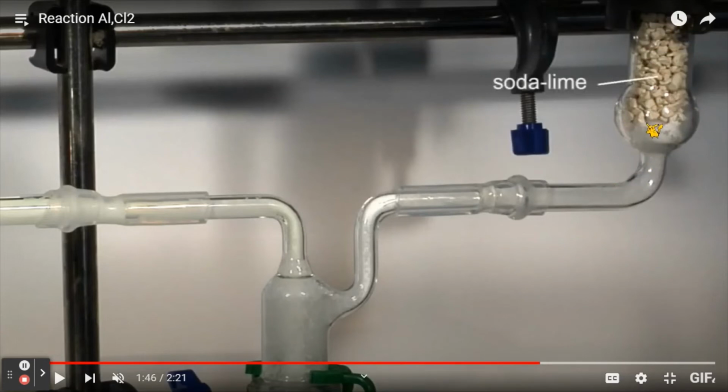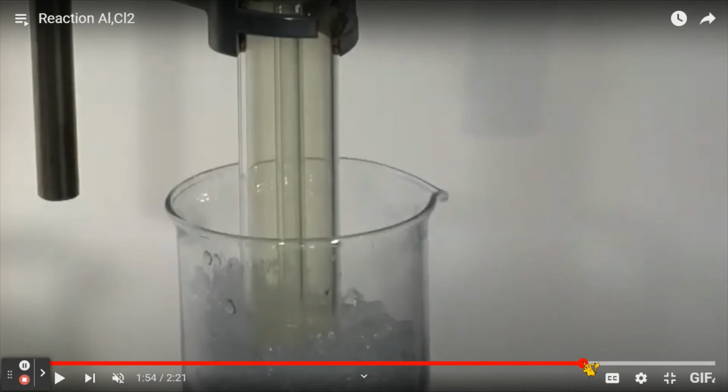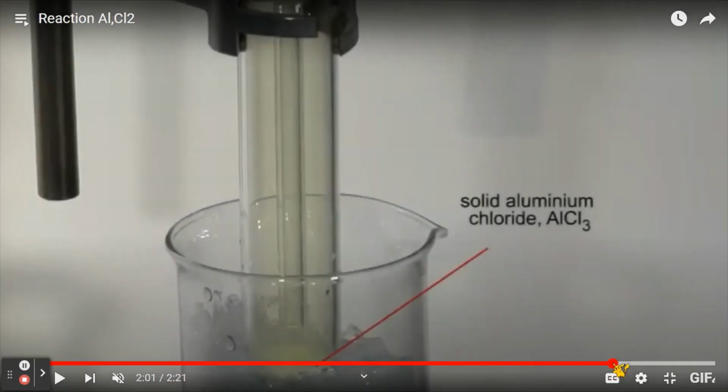No water is going to be coming in through there. No water can come in from the start on the left hand side, and where you see this ice is actually cooling down the outside of where this aluminium chloride is passing through and into a test tube. So this ice and any water that may form is not in direct contact with the solid aluminium chloride. You can actually see that aluminium chloride has been cooled down there.